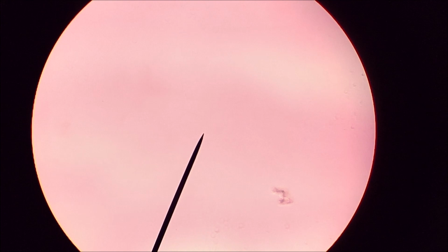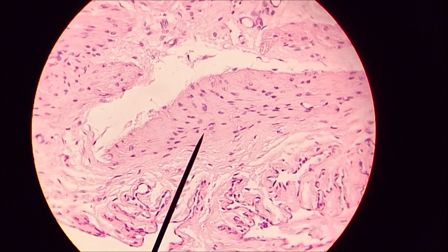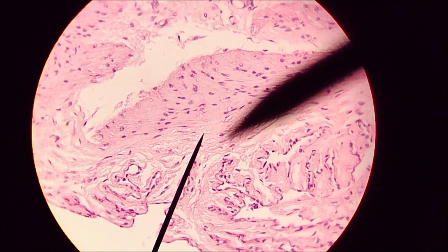Zoom. Oh, by the way, look at that. A little bit of adipose down there. Zoom in a little more. Get the focus right. Let's see if we can find any rivers flowing. That looks kind of flowy. See what I'm getting at? See? Like it's coming through and then up. Let me get in there. So it's coming down and it kind of makes the curve there.